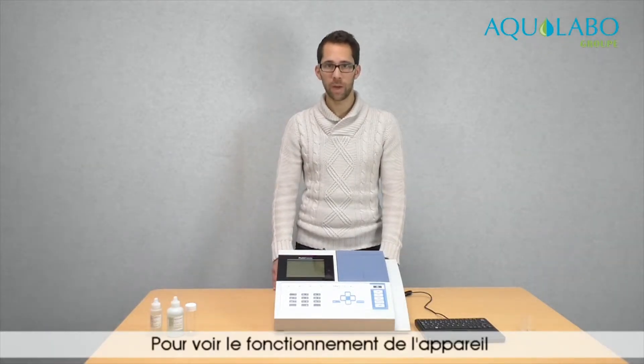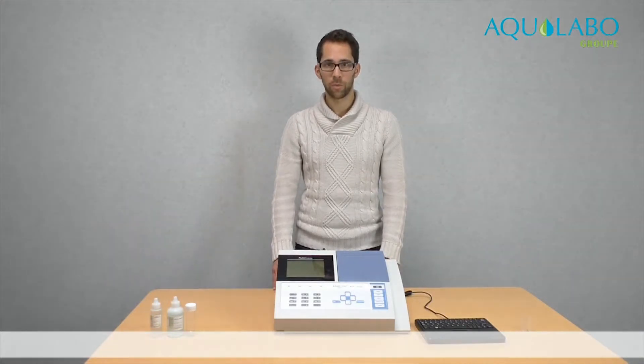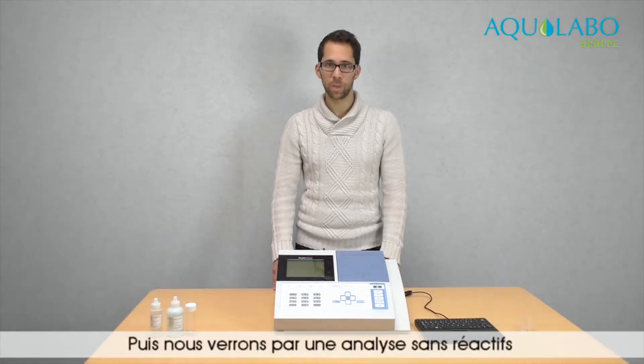To see the functioning of the device, we will conduct an analysis of nitrates. First we will make the analysis with reagents, then we will see the analysis without reagents.